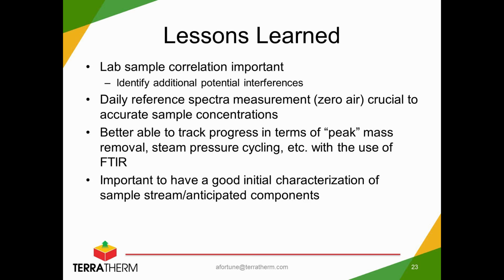So definitely having that accurate baseline measurement proved crucial, and that is something on our system that can be set up automatically to do on a routine basis without the operators having to do it themselves.